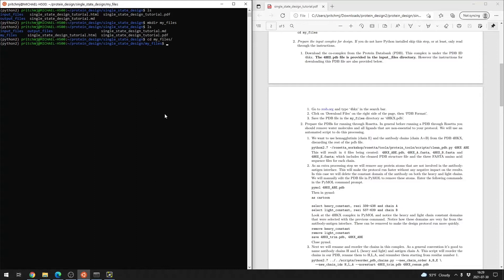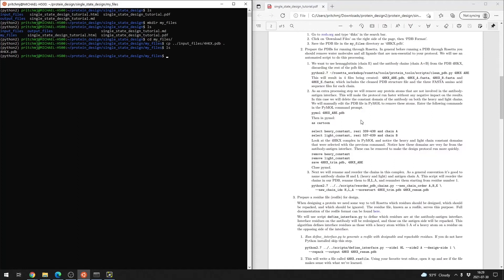You can download the PDB directly from the RCSB, or in our case, grab it from the input files folder. Now we're going to run it through a clean_pdb script located within your Rosetta installation — under tools, then protein tools, then scripts, then clean_pdb.py. We give it the PDB we want to modify and the set of chains we're interested in cleaning, which in our case is all three chains.